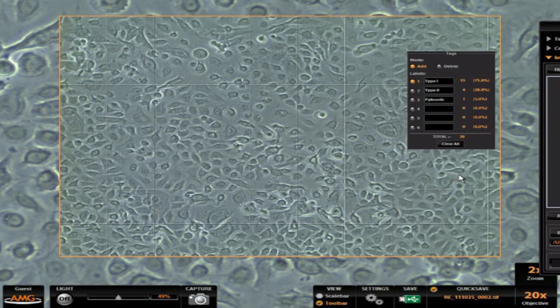Without fluorescence, you can do this basic kind of transmitted light cell counting function. And that's it. That's our cell counting tool and I hope you enjoy using it. And we'll talk again another time. Take care. Bye-bye.